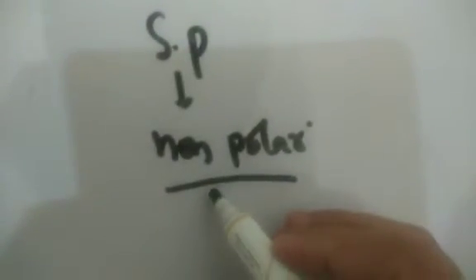What do we do in this case? We won't go too deep at this level. The silica gel that we have, we modify chemically. That means we are basically modifying the surface. We are adhering some long chain hydrocarbons. Hydrocarbons, we know, are non-polar. So now we have attached non-polar hydrocarbons on the stationary phase.